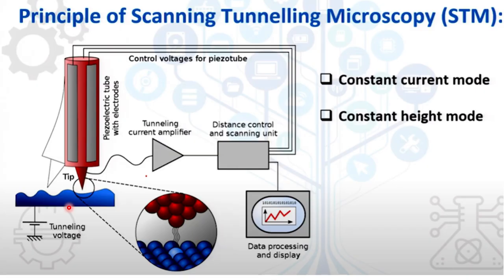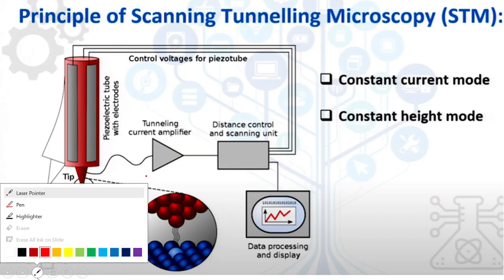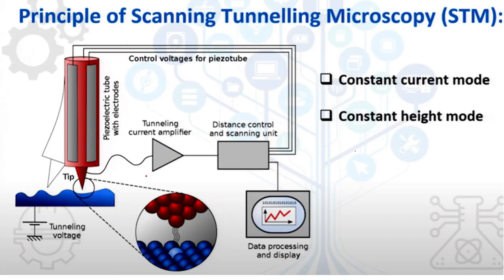A piezoelectric tube means that if there is a change in pressure, it will generate electricity. Now, how is that pressure changing? Just one minute. Obviously, we know that F equal to Kx. So how is the force generated? Of course, K is a constant, and x is the deflection length.